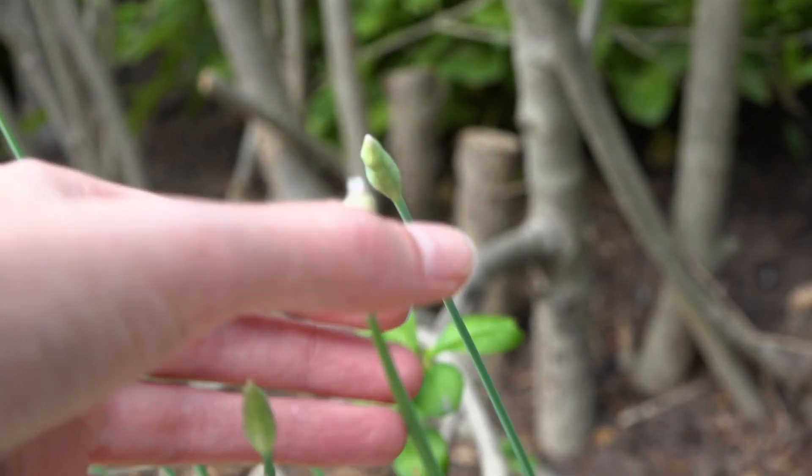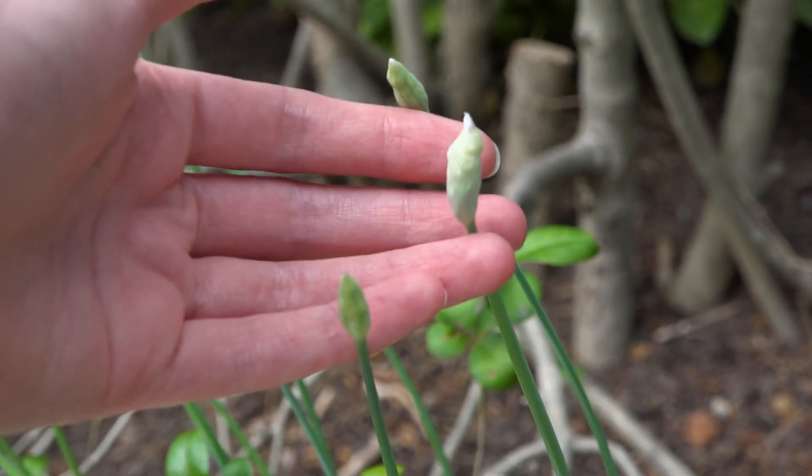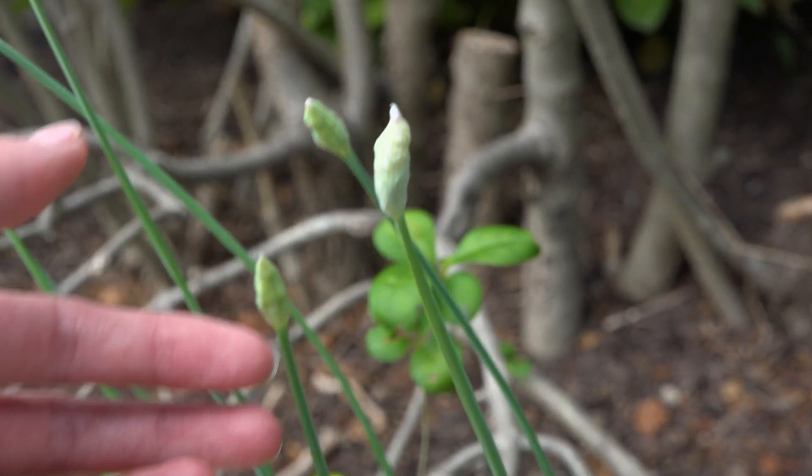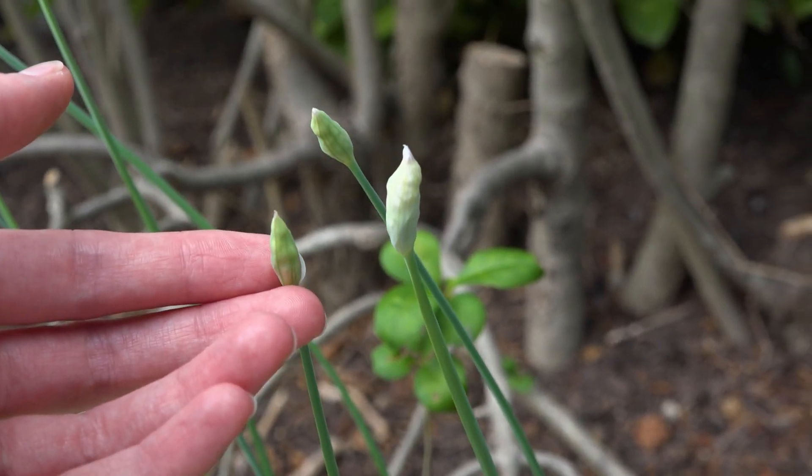I'm using onion flowers because they make these giant heads that contain flower buds at lots of different developmental stages, which is ideal if we want to see the different stages of meiosis.